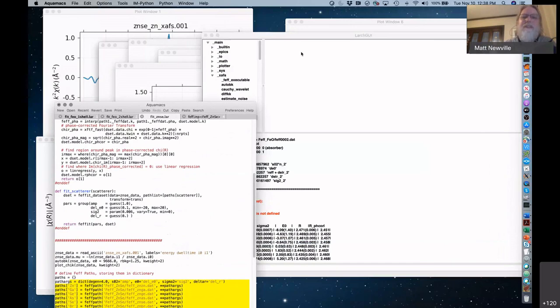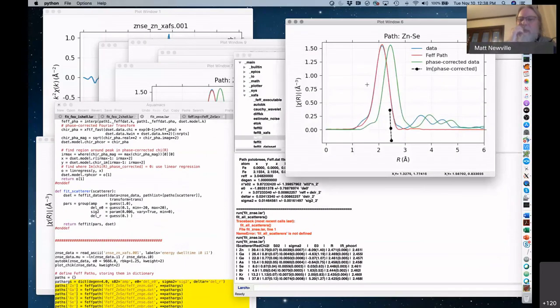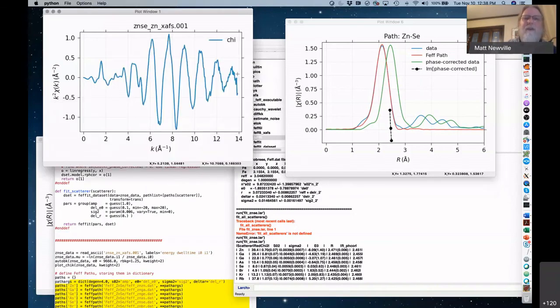So that's to say, it's helpful for including that Z plus or minus 3 or 5. And you might be able to do a little bit better than that. I would say here on good data where it extends out well to 14 inverse angstroms, you might be able to say Z plus or minus 1 or 2, but Z plus or minus 0 is maybe not so great.